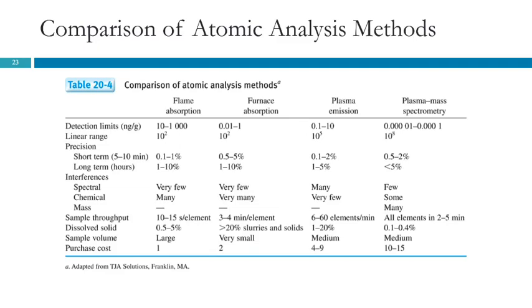There's a name for it, but I forgot what it's called. There's a lot of really kind of crazy ions that can form, like argon plus and other odd things that don't happen at room temperature. But in the extreme heat of the plasma, they can happen. And then you've got different isotopes as well. And so you combine isotopes and ions, and you can get some mixing up, right?